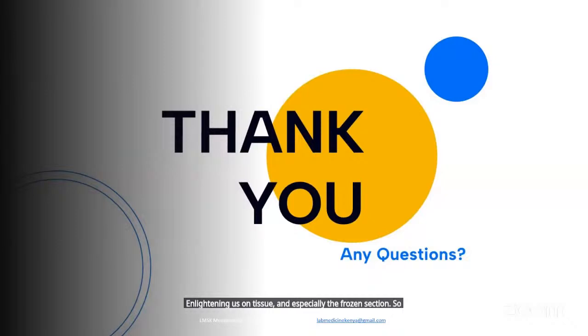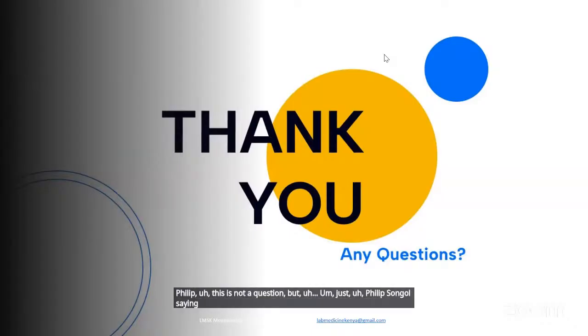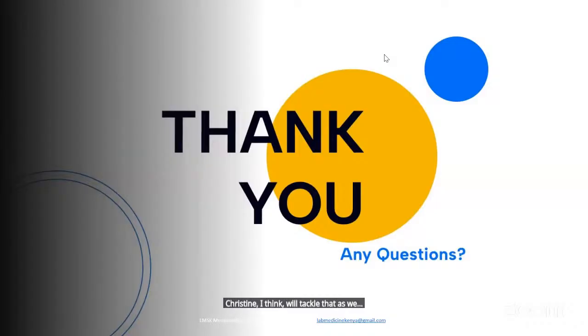So I would want us to tackle the questions that are streaming in. The first one that I would want you to tackle is Philip. This is not a question, but just Philip Songol saying it's a great presentation. And the first question comes from Hilary Toom. Hilary Toom says, hi, is there a way of preventing ice crystal artifacts in cryo section or frozen section? Christine, I think we'll tackle that as we get more questions coming in.